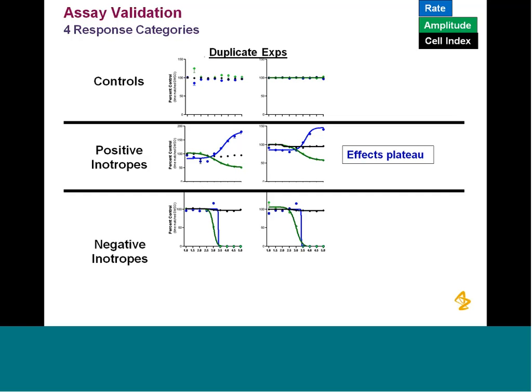So what is it? It's an assay that measures contraction of these cells, but it doesn't have all the afterload and preload of in vivo. So it's going to have to be part of a cascade. And I don't think we want perfection to be the enemy of good. We need a frontline part of our cascade. We can't have dog assays being our primary screen. It's just unsustainable drug discovery. So that's not an answer. That's kind of my take on it.